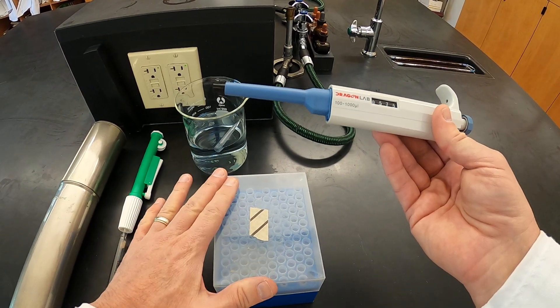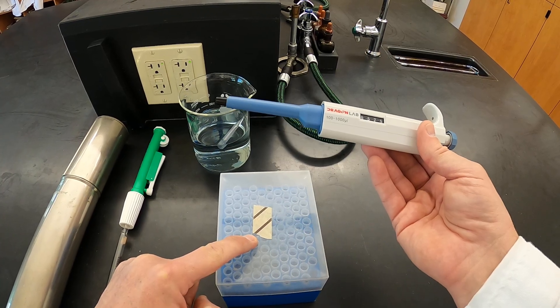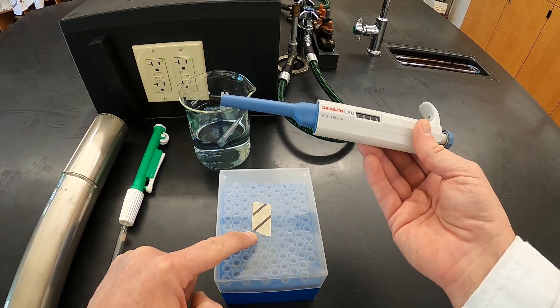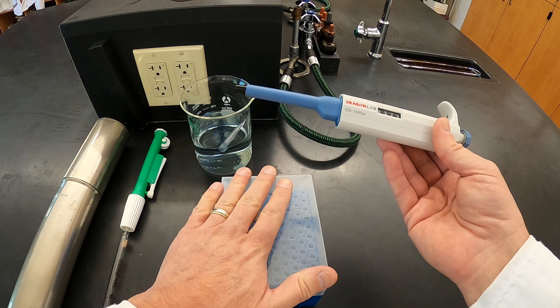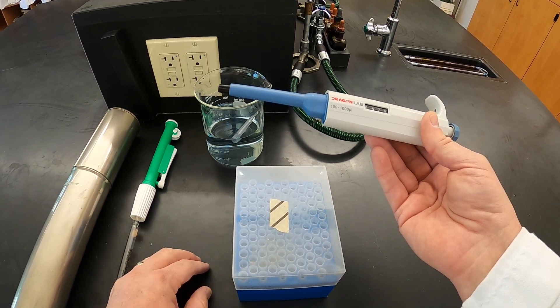So you'll notice with this disposable tip box that it's been sterilized, you can see that from the tape that is color changed here. And we want to be really careful to keep these uncontaminated as much as possible.